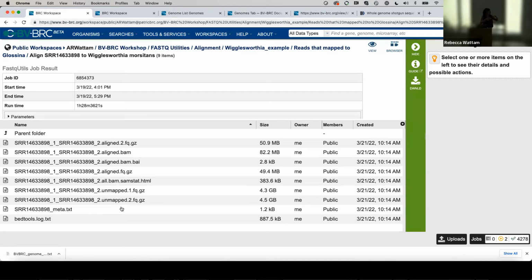So I mapped it, ran the same reads, mapped it once to Orientia, mapped it to human, but I've taken the same example and mapped it to Rickettsia, to Coxiella, and I believe I had Bartonella in there too. So 3 different ones from the same set, and then I had those reads aligned.